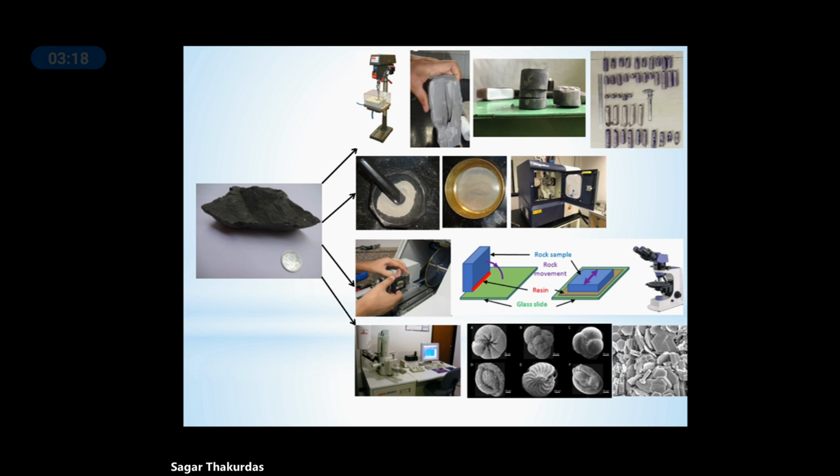In optical studies, you can identify certain organic matter or some pore spaces within these organic matters or between the rock matrix, but it is difficult to identify individual clay minerals within the shale with this optical method, whereas the XRD analysis gives you detailed information about the different minerals present within the shale. So the resolution is much better in XRD compared to optical study, especially in the case of shale.